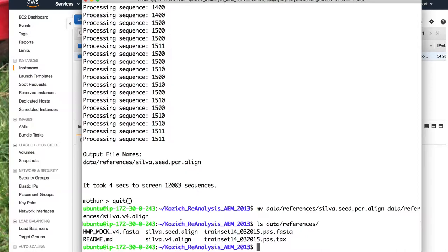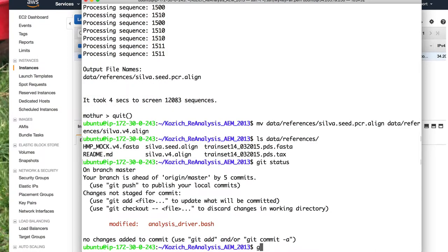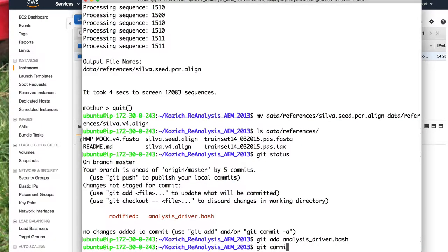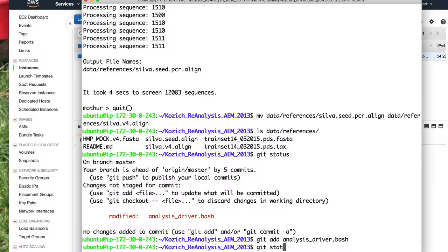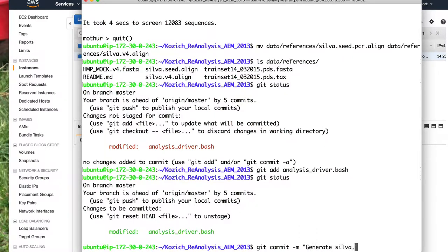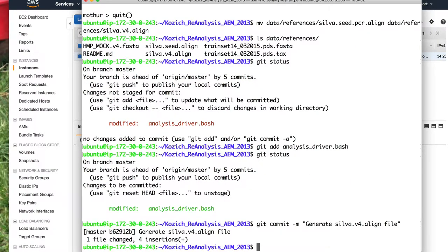So what do we want to do? Let's commit. We'll do git add analysis_driver.bash, git status, git commit -m 'generate silva.v4.align file'.